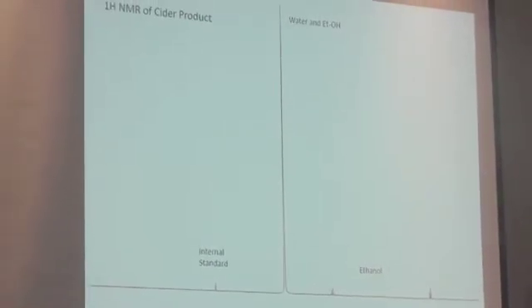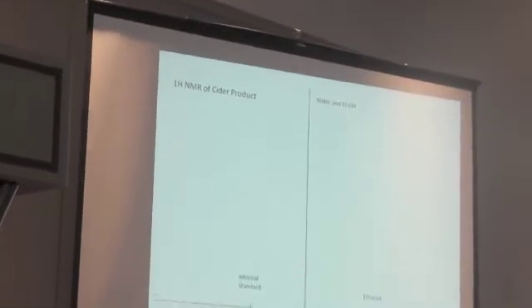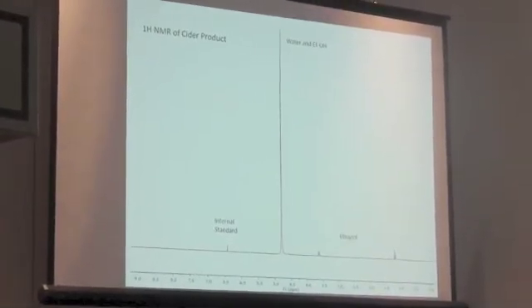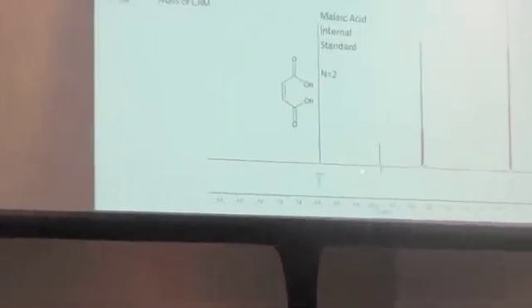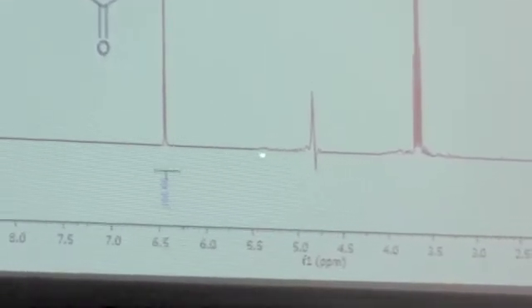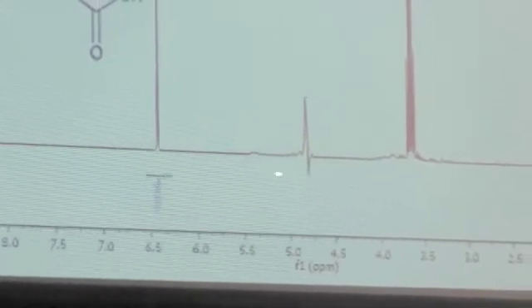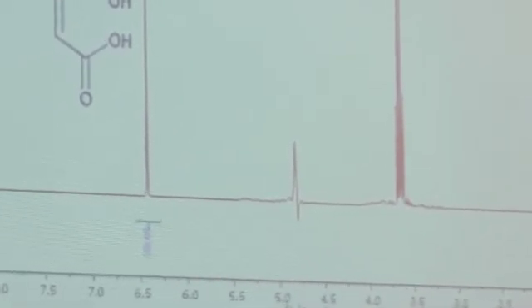There is a way that we can irradiate at exactly this frequency with radio waves and kill that water peak. So the water molecules are going nuts, so that when you do a pulse to look at the spectrum, the water molecules are all over the place. They don't have a coherent signal that will give you a good signal, so they give you a weird looking signal that looks like that. And part of the problem is, if you're really interested in the sugars, like this is a beer, and this is all the leftover malt that was in the beer, this distortion kind of screws up what you can see in here. So a lot of times I run a sample straight, but then I'll freeze dry the sample.